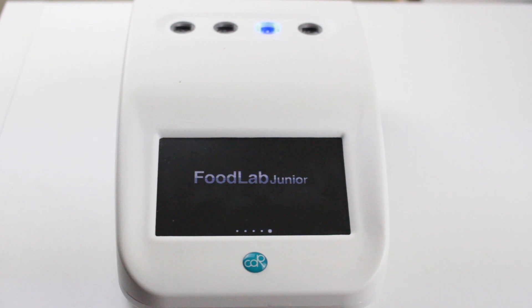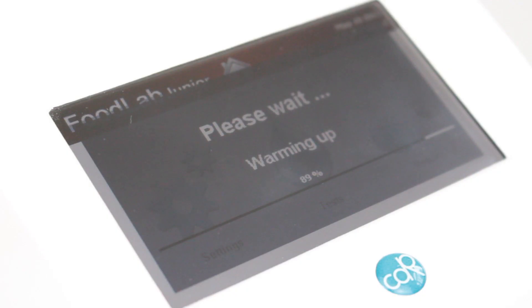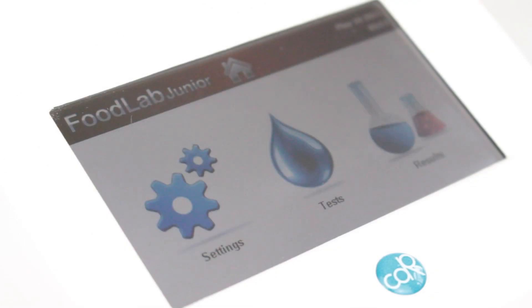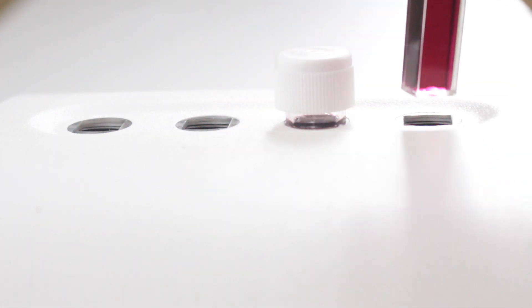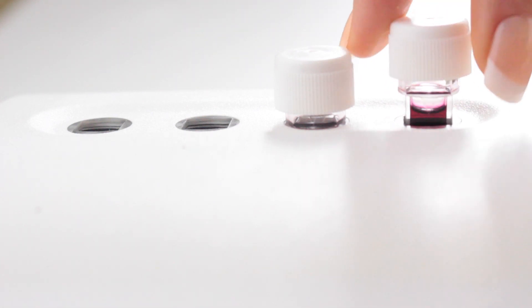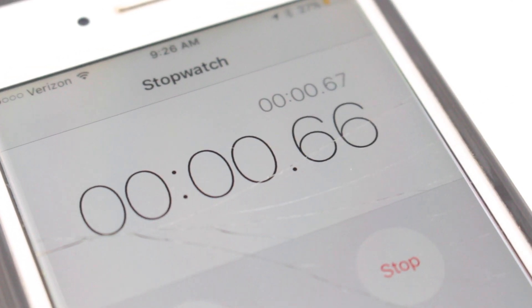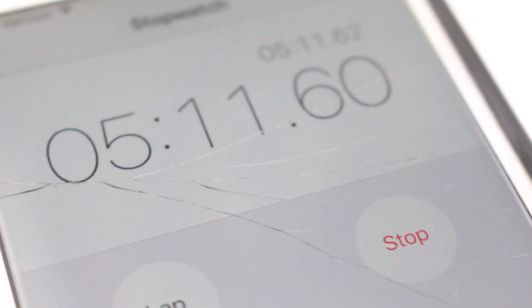From here it will take the analyzer about five to seven minutes to finish warming up. What this is doing is it's bringing the incubation and reading cells to the proper testing temperature. Once your analyzer has finished warming up, place the reagent cuvettes into the incubation cells and allow them to incubate for at least five minutes.